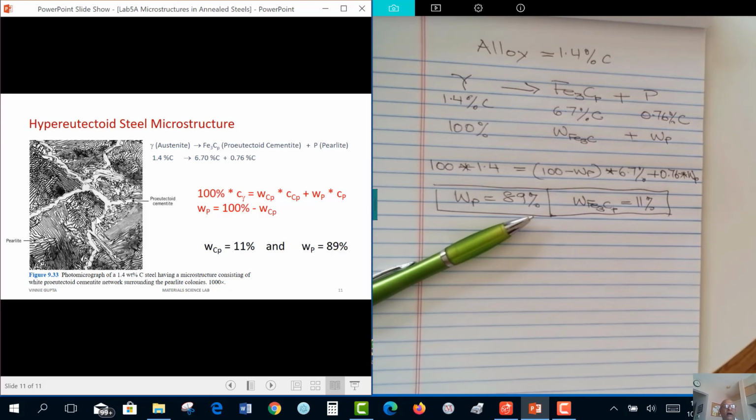And this is very, very hard. Now this kind of a structure is not very good because it is going to be brittle. So remember, you have a very brittle, hard layer that is connecting the entire cross section. So if a crack were to happen, it is going to propagate very quickly through this channel. So this structure is not very good mechanically speaking.